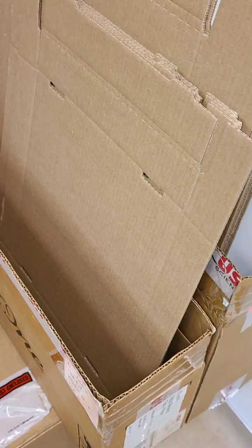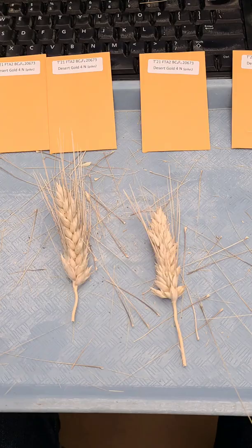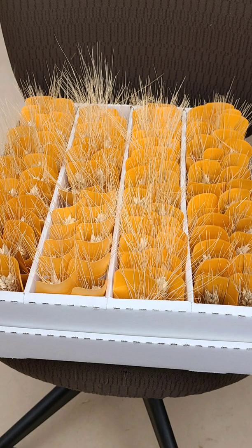I then spend the rest of the day making this box and then counting spikelet number per spike on my harvested spikes from Tulelake, which is a bunch of fun, but at least easy work and necessary data.